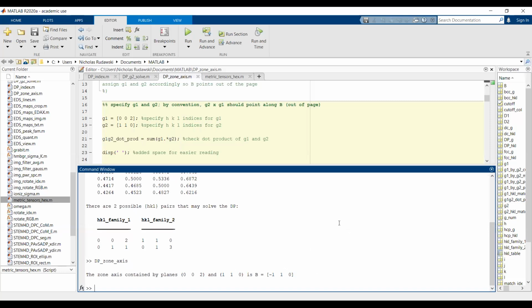If we do the same thing for the second index, we're going to get 2 minus 1. So that would give me, wait, that doesn't make sense. Okay, no, sorry, let me backtrack. First index, I have 1/3 times 2 times minus 1 minus 1.